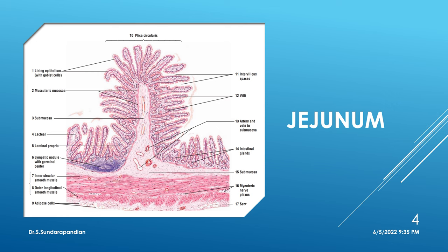Now the important point: look at the submucosa. Here we have the routine content of submucosa — moderately dense connective tissue with blood vessels and nerve plexuses. The nerve plexus present in the submucosa is Meissner's plexus. There are no glands here in the submucosa. But in the lamina propria you can make out small glands called intestinal glands, also known as crypts of Lieberkühn.